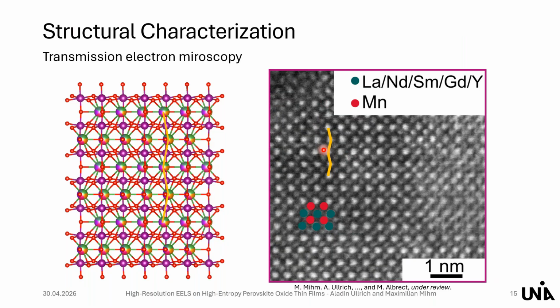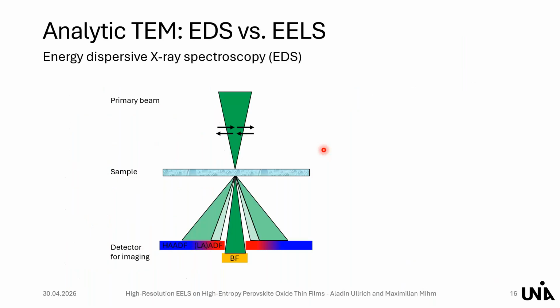So let's begin first with a short repetition of the scanning mode of a transmission electron microscope. So when you're doing STEM in such a microscope, you have a very focused electron beam. It's focused to a very small spot and rastered then across the sample, indicated by these black arrows. So by this, you get a very high intensity of the beam on a very small spot on the sample. What's important, as you will see later on, is that this very intense beam can also damage the sample. And to control this is very important.